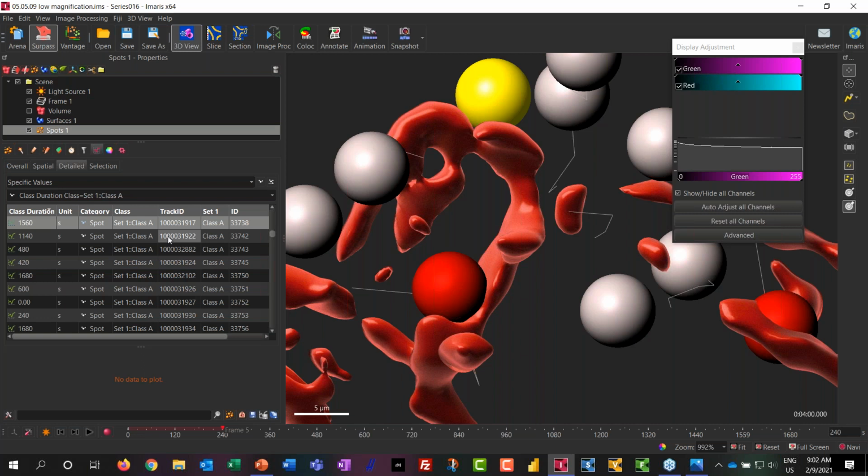It is available within advanced preferences to adjust it. I probably should not have even said that because someone will probably go and look, and I would want you to speak with our support team before you adjust anything within advanced preferences, but there are some places where you can change things within there. Again, initially the default is based off of the size of your voxels, and from there it is possible to change, but we don't often recommend it.